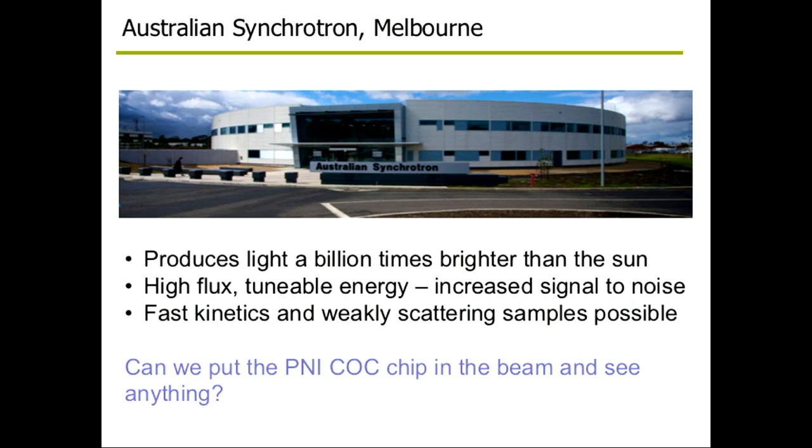And so what that means is the sort of experiment that might take at least an hour on a lab system, we can do in 10 milliseconds on a synchrotron. So we can now access kinetics that's changing in a really fast manner.